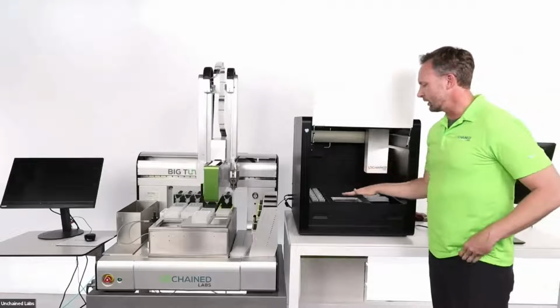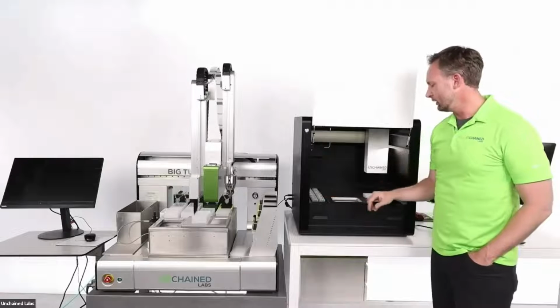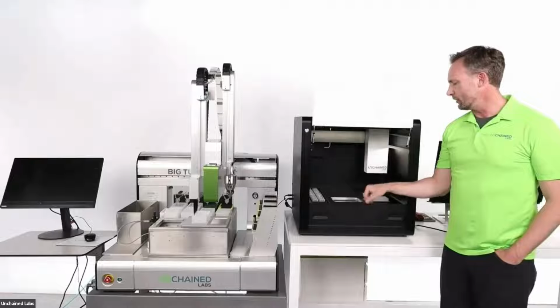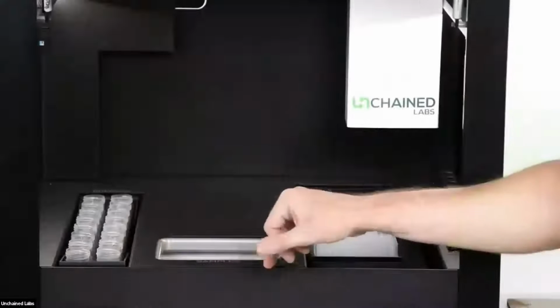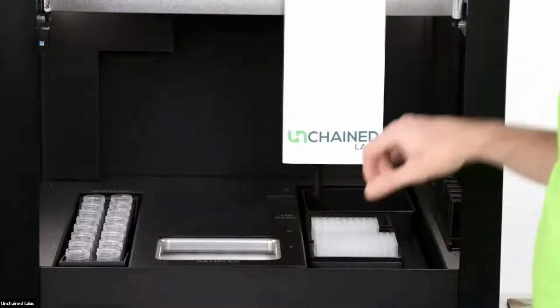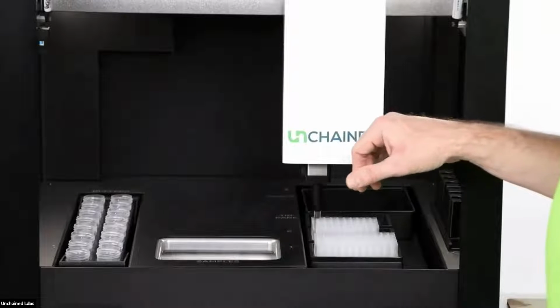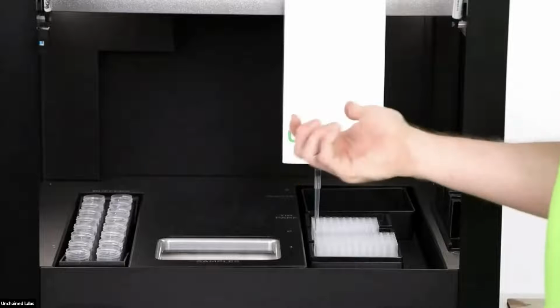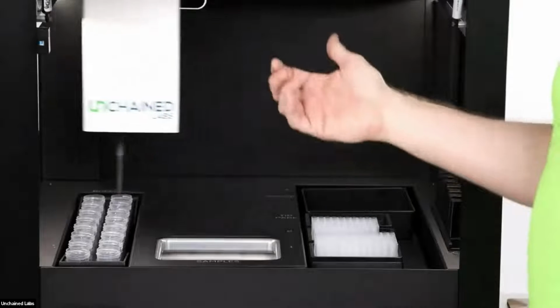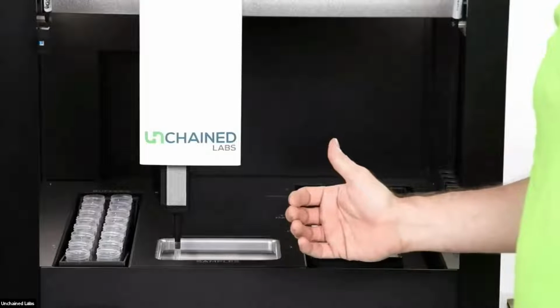So for Unagi, again, its buffer reservoirs are contained in these Falcon tubes. And I don't know if you're quite able to see, but now that orbital mixer is mixing all of our UNAs that are in that sample rack. And then it's going to come over, grab a tip, and with this single 1 mil tip, using air displacement pipetting technology, it's going to be able to do the buffer additions for you.